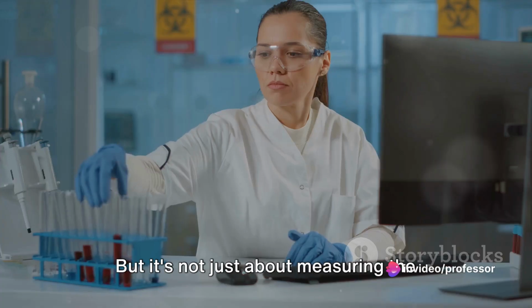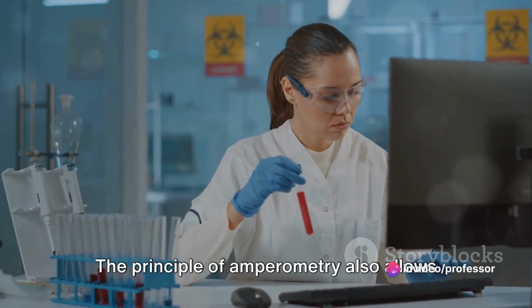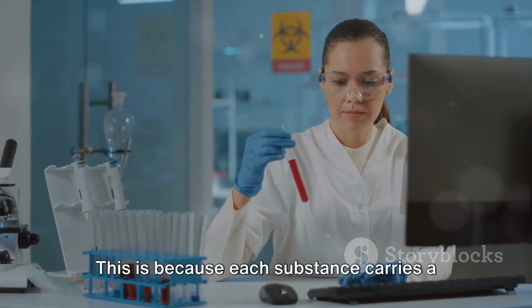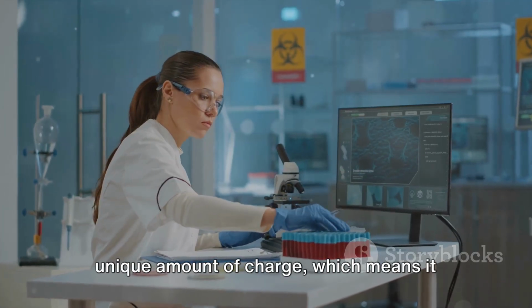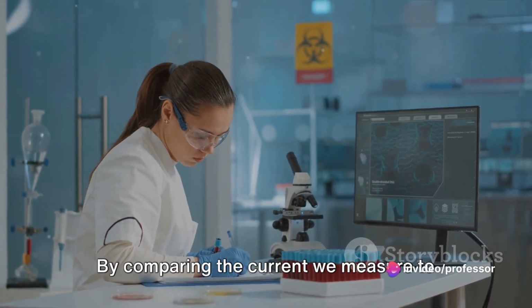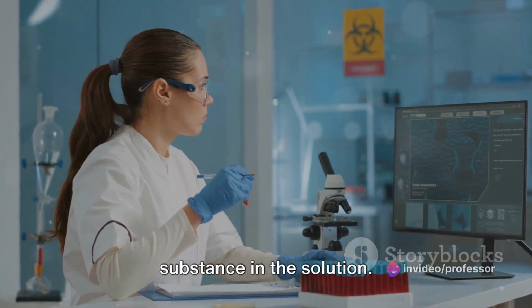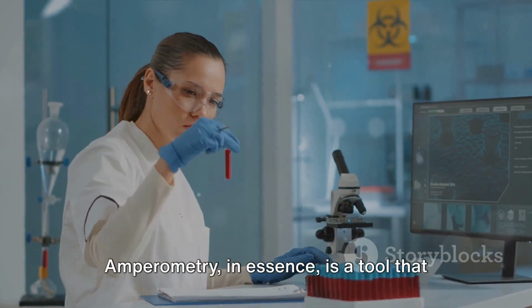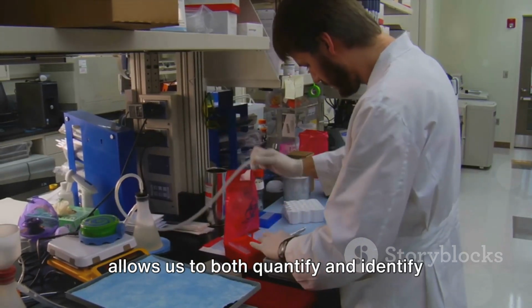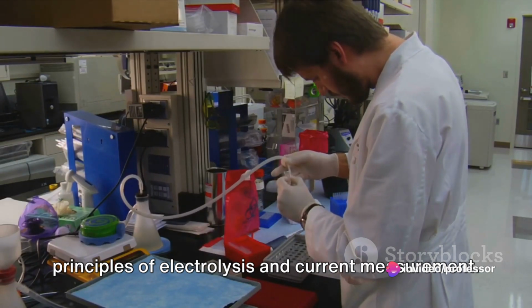But it's not just about measuring the amount of a substance. The principle of amperometry also allows us to identify the substance. This is because each substance carries a unique amount of charge, which means it will create a unique current when a voltage is applied. By comparing the current we measure to known values, we can identify the substance in the solution. Amperometry, in essence, is a tool that allows us to both quantify and identify substances in a solution using the principles of electrolysis and current measurement.